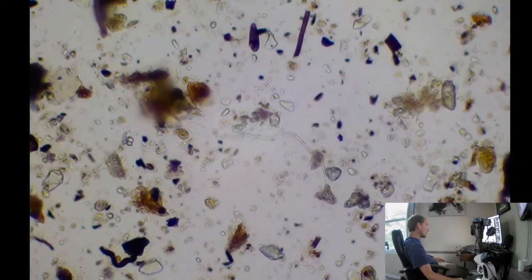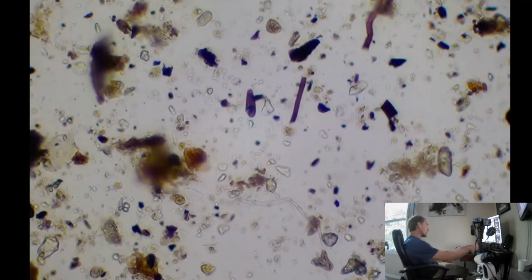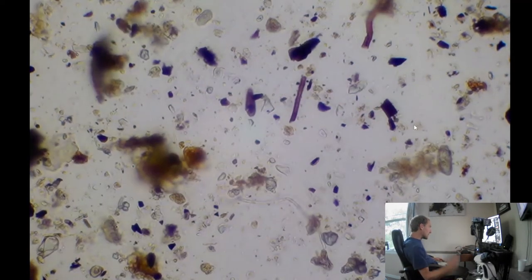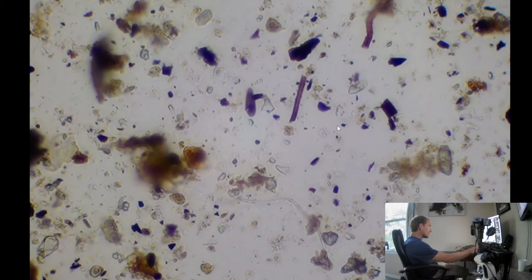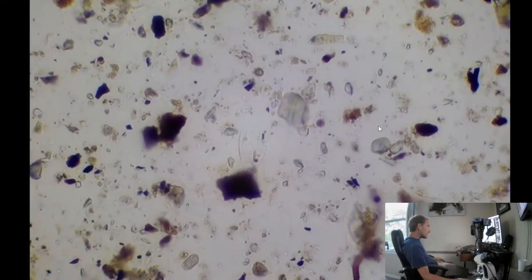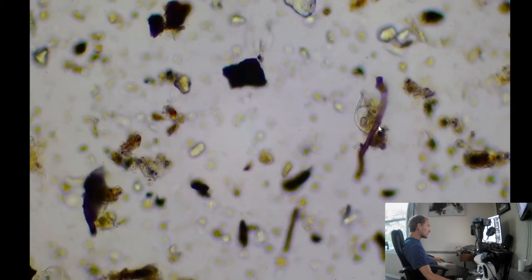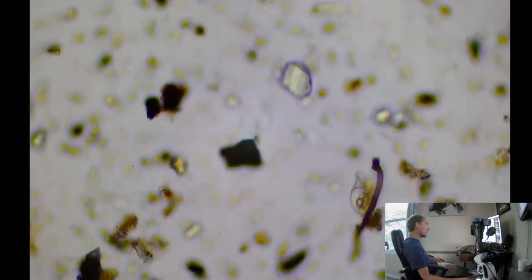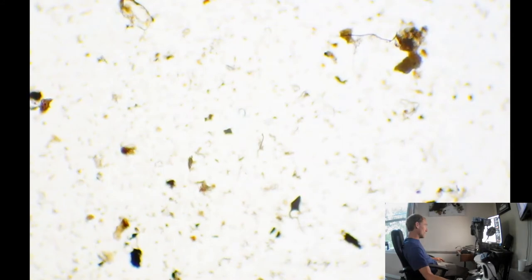Where were we? Ooh, yeah. That may be a spore. There's a piece of fungi. Can we see the... Yep. See a little septum there, separation in the cells. Yep, see a couple more breaks there. One line right there. Another line there, I believe. That's a nice fat colored fungi type you want to see. Alright, so now we saw a good fungi.